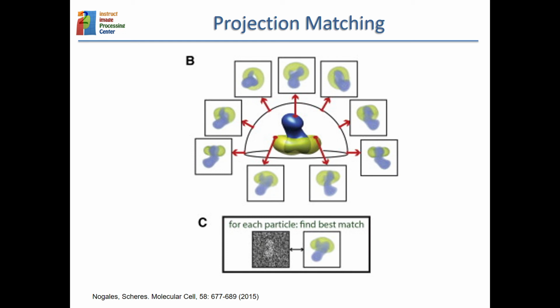And then that allows you to perform 3D reconstructions, because when you have an experimental image like this one and you have a reference volume like this one, you are trying to figure out, okay, this experimental image, where am I looking from this 3D object? So this must be some projection along some unknown direction of this object.